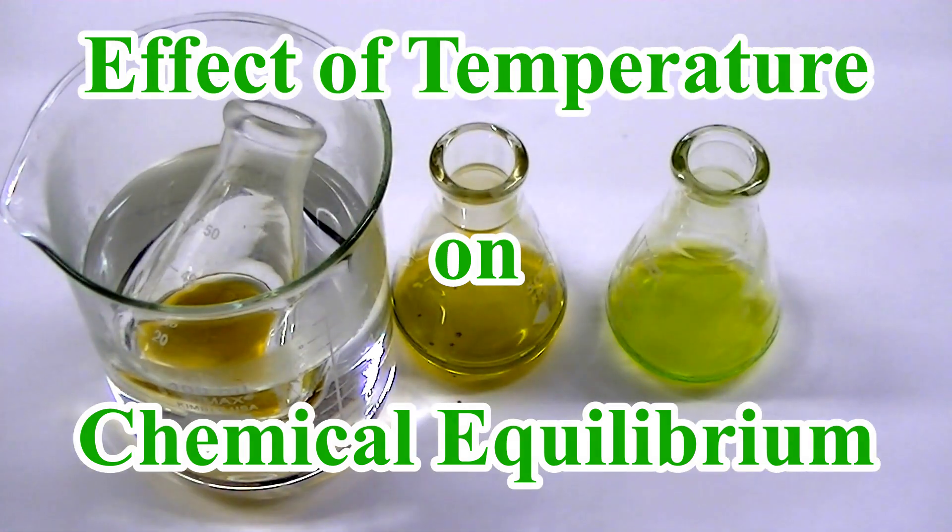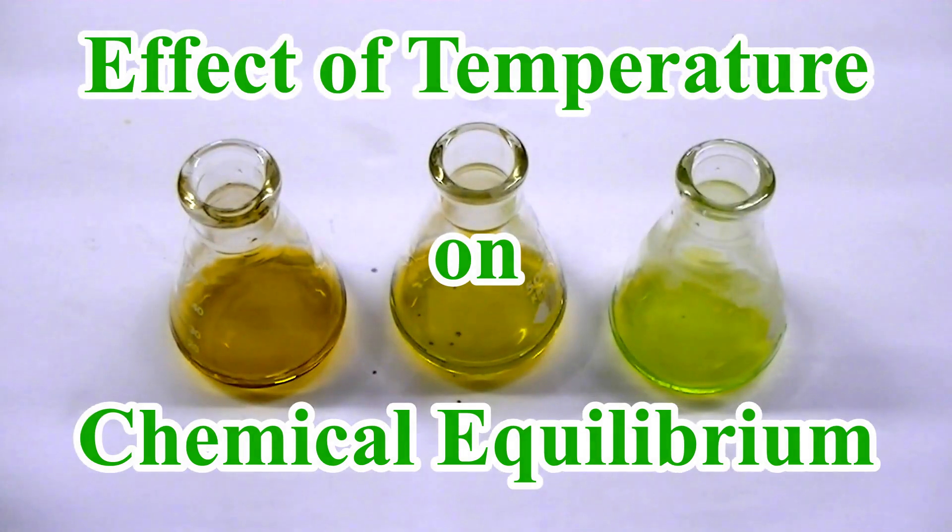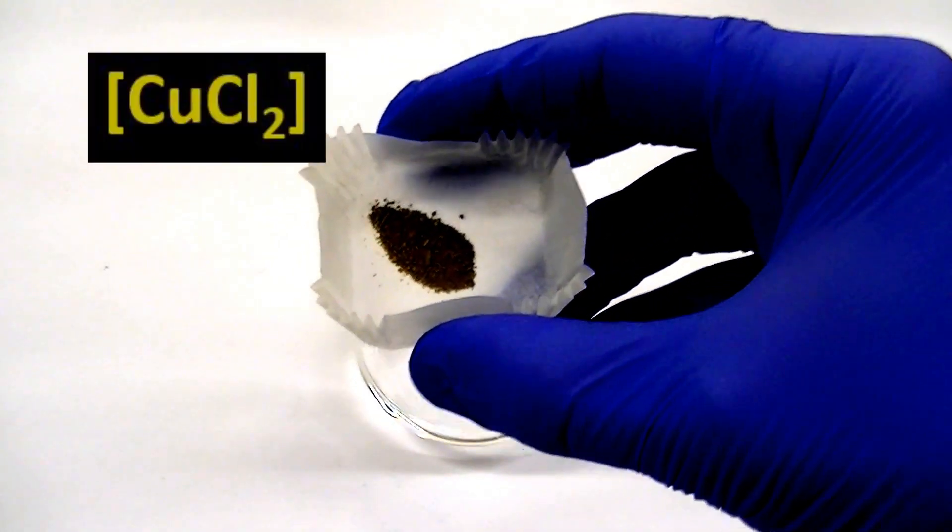In this video, we'll explore the effect of temperature on chemical equilibrium. The particular system involves chloro-complexes of copper II.